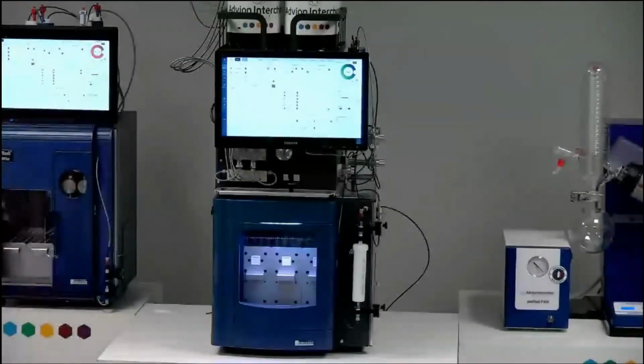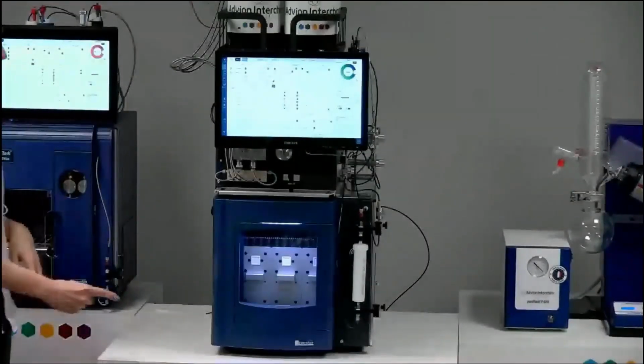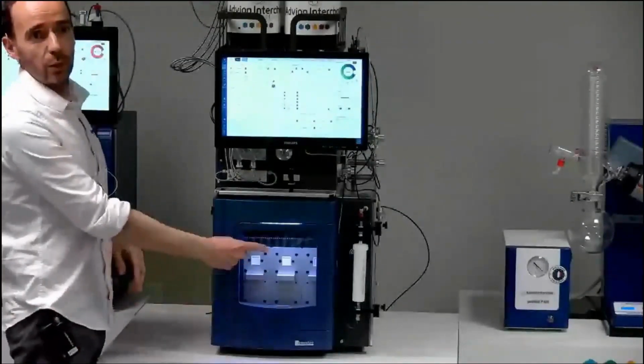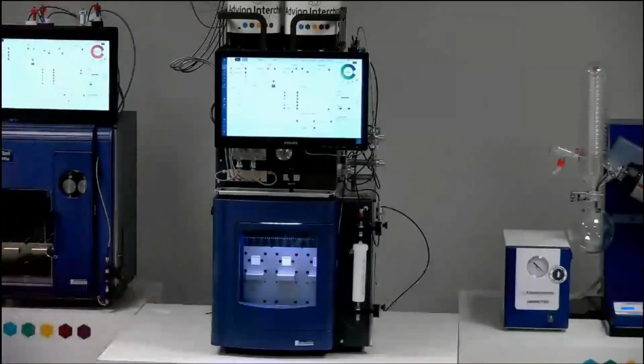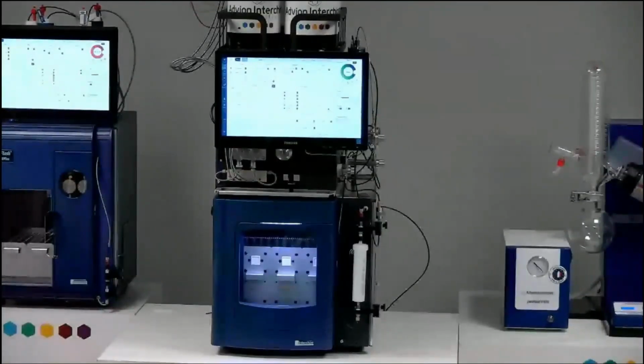A last point for the safety, you can see just there inside the collector, you have a light color. So it's a light status of the instrument. It gives you the status of the instrument, and you know the status just by a visual check. We have one color by status. So in blue when it's standby, in green when it's in run, and if you have something wrong, it will light in red.